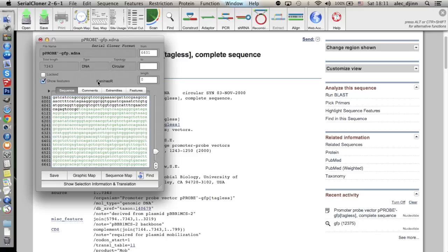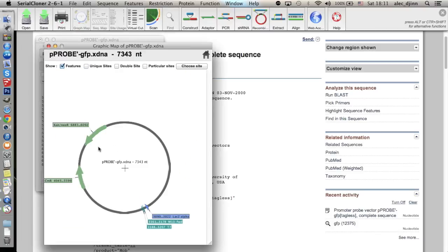And here we have a kanamycin resistance gene. So we already know that this plasmid codes for a Lac-Z-alpha peptide and two distinct antibiotic resistances. Looking at the graphic map now, these new features appear. Protein coding regions are indicated by arrows — the orientation of each arrow resembles the transcription orientation. The base of each arrow is where the protein starts, the N terminus, while the tip or head of the arrow is the end, the C terminus. Also, if the arrow points clockwise, it means the gene is on the plus strand, while if it points counterclockwise, it means the gene is on the minus strand.